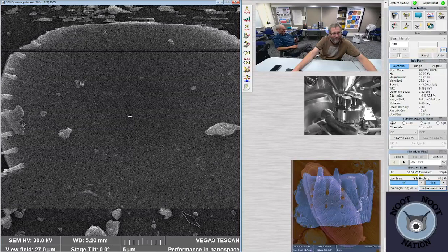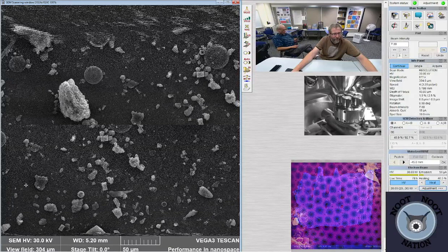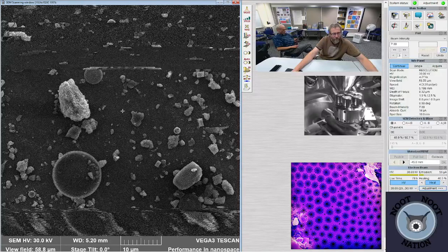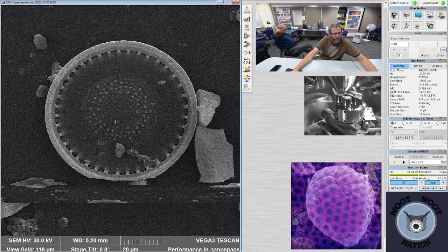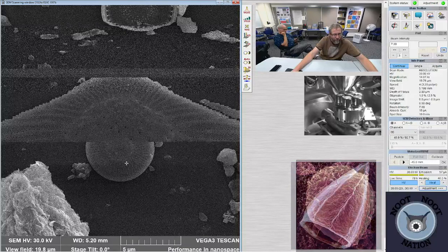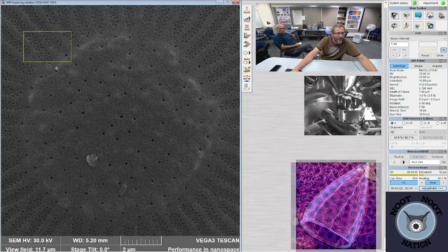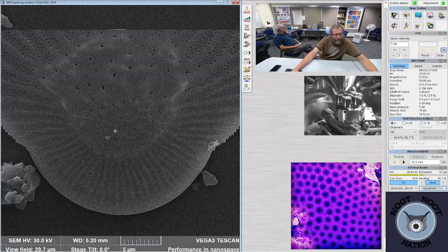It's a Stephanodiscus. Niagarae. Okay. Oops. I'm going to take a picture of this one and then I'm going to call it a day. I'm going to meet Rick here tomorrow. See, speakers are still here.